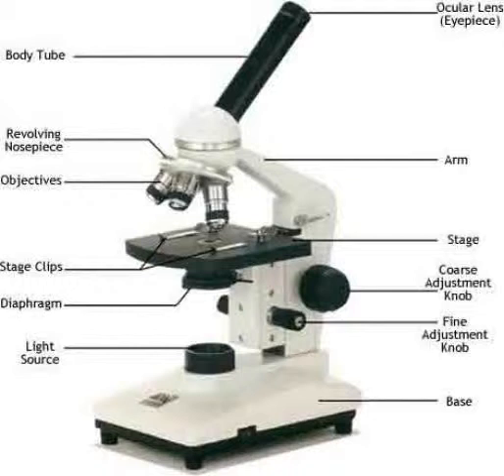Microscopic observations. Number 1. In addition to whole cells, you will often wish to observe the parts of a cell. A good example of a part of a plant cell is a grain of starch. The potato stores energy made by photosynthesis as grains of starch. Starch grains appear white in the normal plant cell and are not easy to see. To make them more visible, you will stain them with iodine, which turns them black.